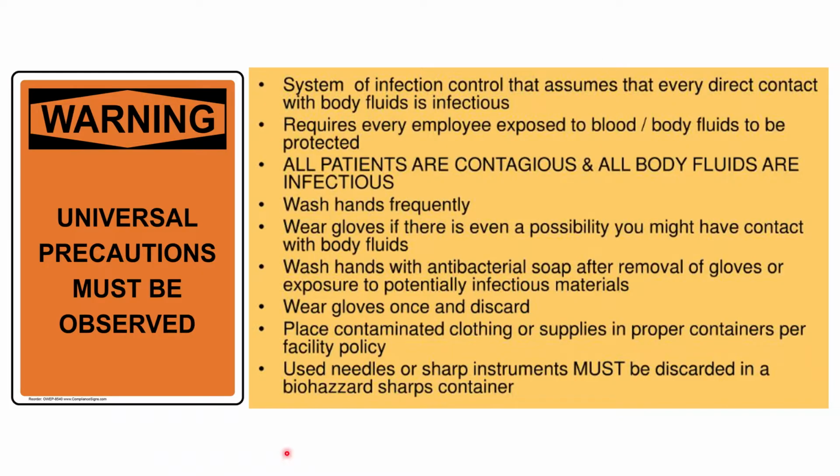We are expected to develop an understanding of the risks associated with these hazards, and we are always reminded to be safety conscious at all times. If you remember my discussion in PMLS 1 regarding biosafety and biosecurity, we are always informed of the different hazards and we have to recognize them so that we will be able to prevent them or, as much as possible, eliminate those types of hazards.